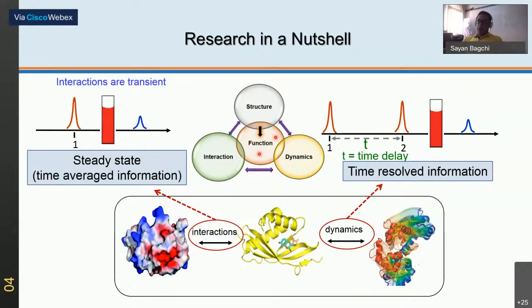And how the structure-function relation happens on the basis of interaction and dynamics. So in our lab, we are interested in both interactions and dynamics. But today, I will talk about 2D IR, where the strength is the dynamics part.